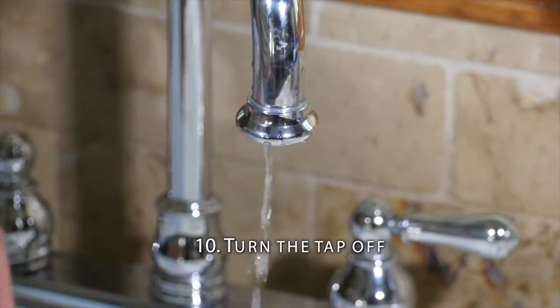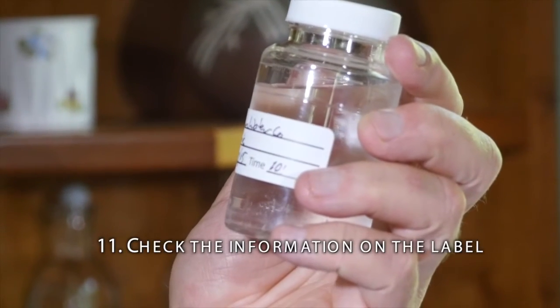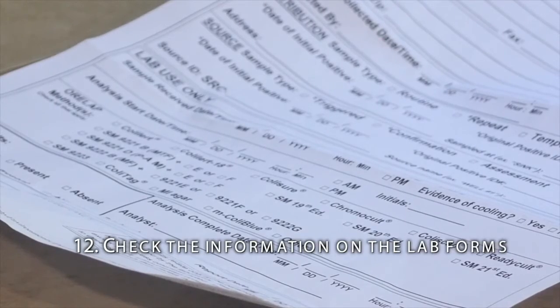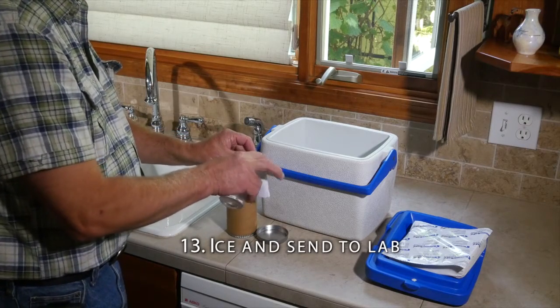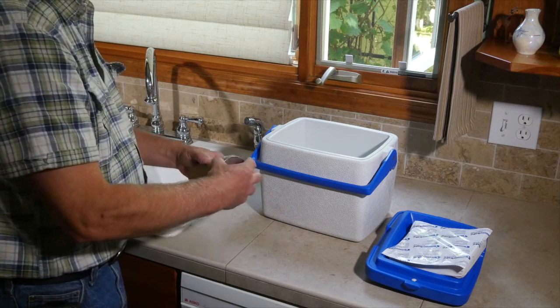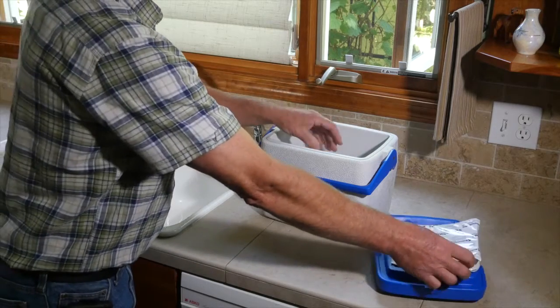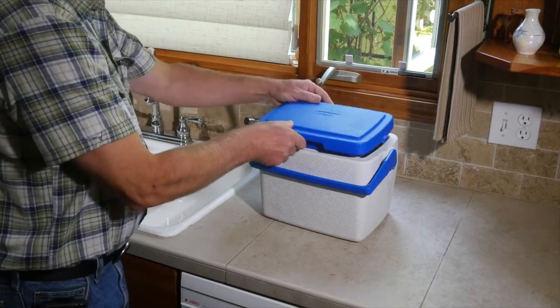Turn the tap off and replace the aerator, strainer, or hose. Check the information on the label. Check the information on the lab forms. Be sure that it is legible and correct. Ice and send the sample to the lab so the analysis can begin within 30 hours. Refrigeration is recommended. You can use a cooler with an ice pack. The quicker it gets to the lab the better. Be sure that you are using a certified laboratory for your analysis.